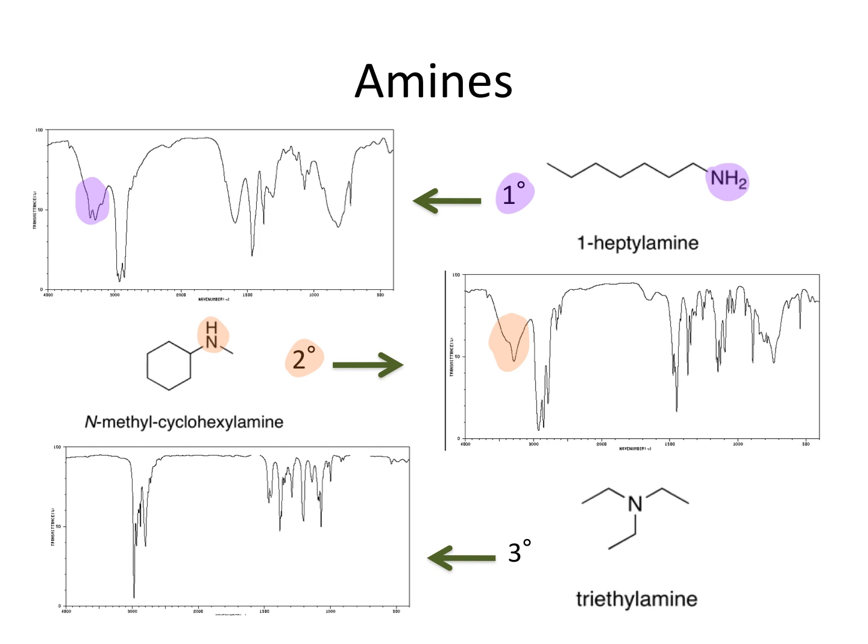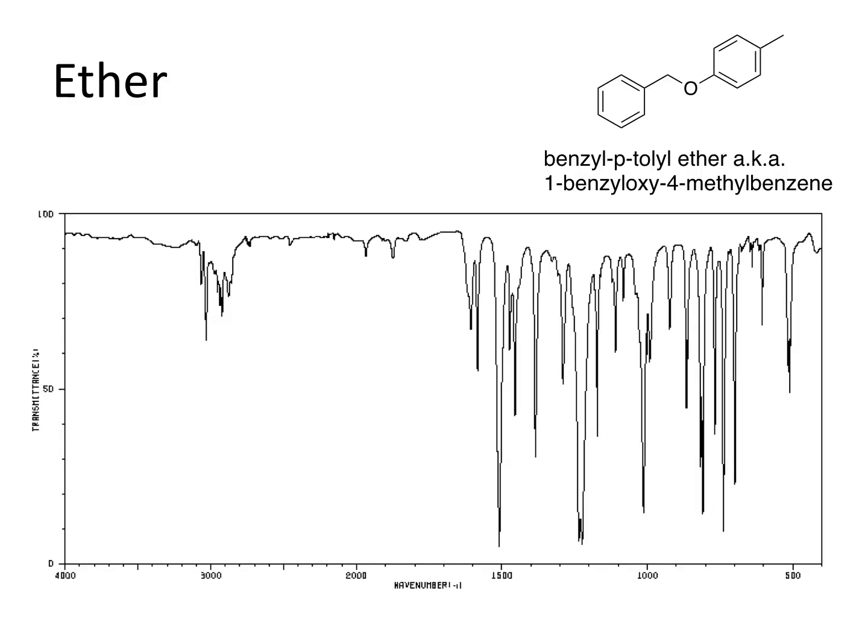The shapes are different. If you look, the one on the top is primary. That's the shape we just saw. The one in the middle is called secondary. It's a slightly different shape, right? It looks more like it's got a pointy finger, but it's still kind of rounded. And then the one on the bottom doesn't have a peak there because there's no NH, which is the key peak we're looking for. So I won't give you any like the bottom anyway, so you don't have to worry about those. All right, so we're going to start going a little bit faster through these, hopefully.